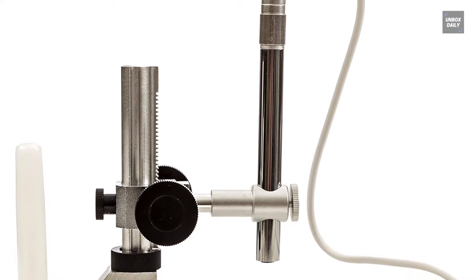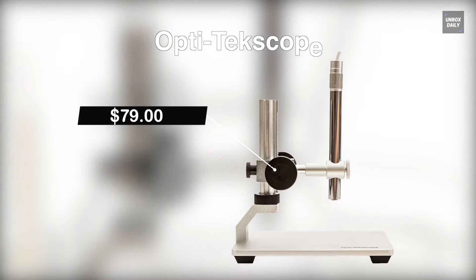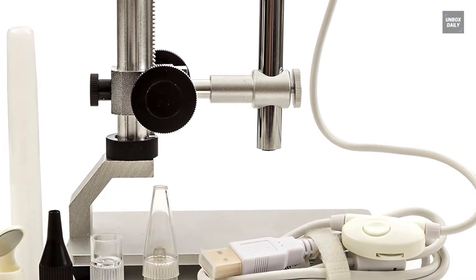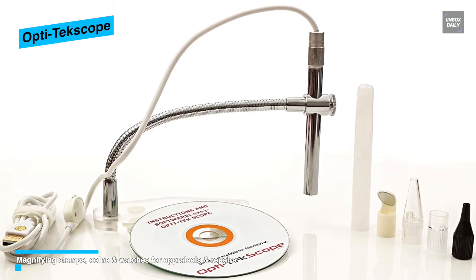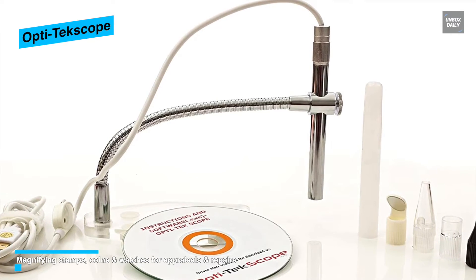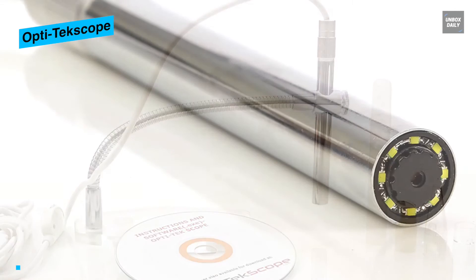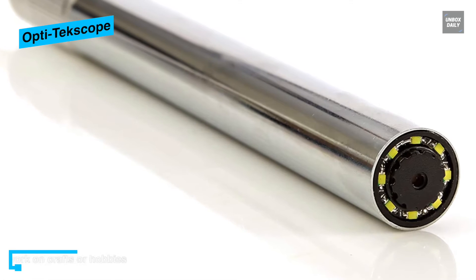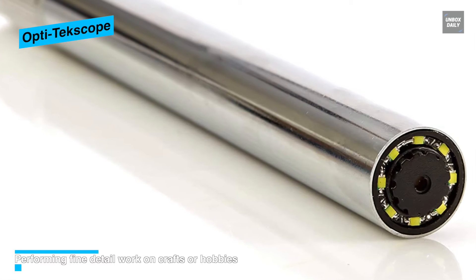The OptitecScope Digital USB Microscope Camera features a high-level CMOS sensor that delivers superior quality 1600x1200 resolution, adjustable lighting with 8 LED lights, and a USB cable for connecting to a PC. With up to 200x magnification, this microscope can capture fine and clear details, and can also be used as an endoscope.